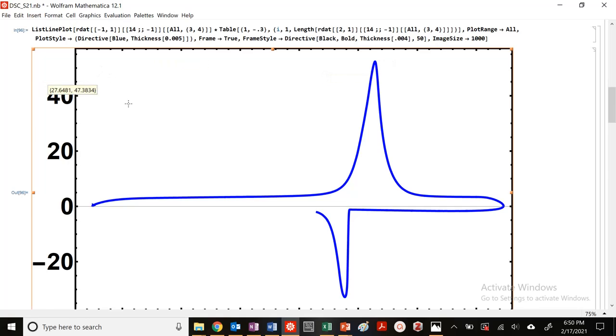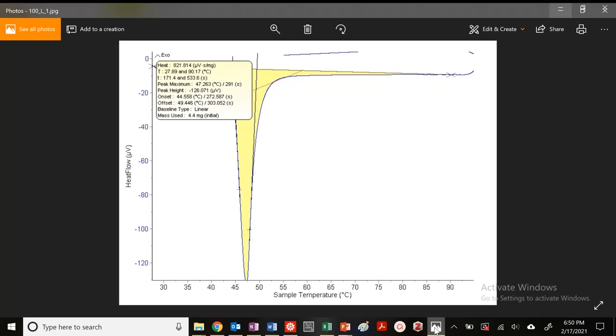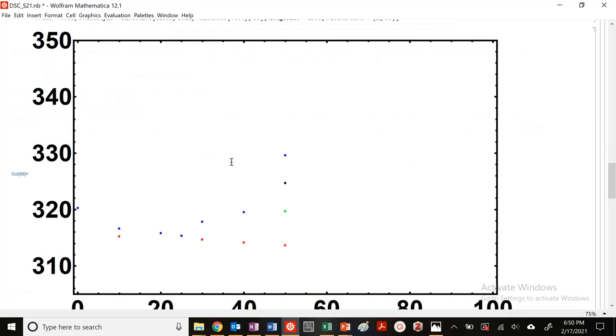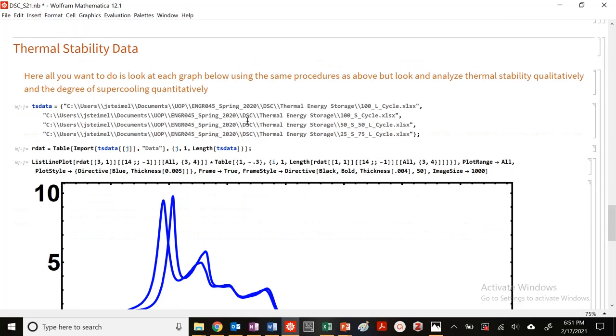that type of material. So, but in addition to the enthalpy of fusion, which we're going to calculate, the enthalpy of melting, which we're going to calculate by taking that integral, multiplying by 0.3, and additionally, in developing this phase diagram and figuring out the melting temperatures, we also want to look at two kind of quantities, which is thermal stability and the degree of supercooling.